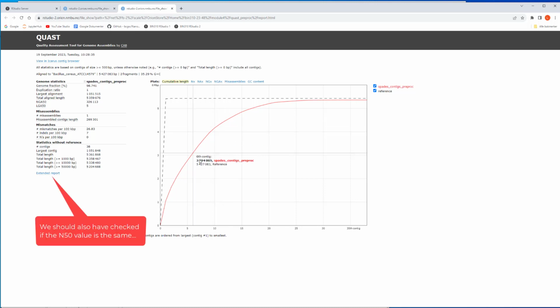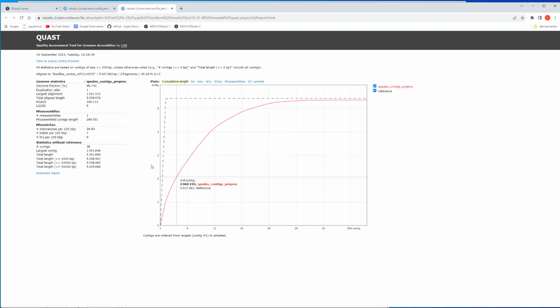And this is often the case, I would say. The pre-processing rarely alters the big picture. So you can really ask, should I bother do this pre-processing? Well, I think most people do it, but keep in mind it may matter for some details, but apart from that, it's not super important.